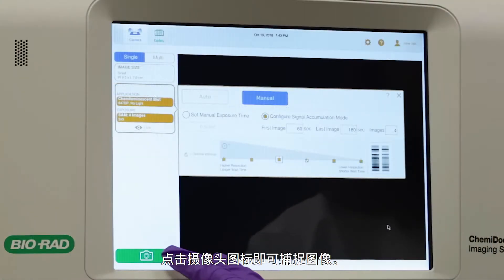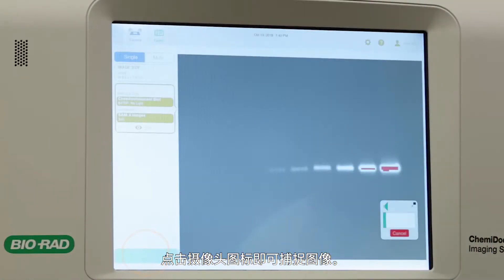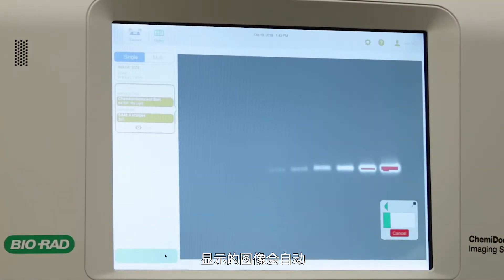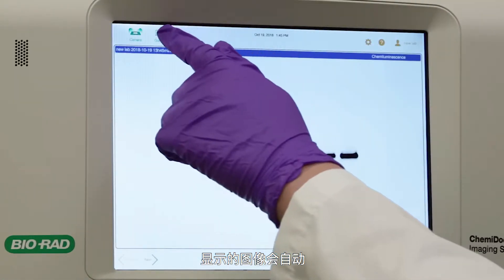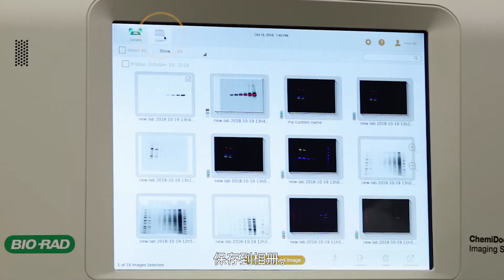Tap the camera button to capture the image. The image that appears is automatically saved to the gallery.